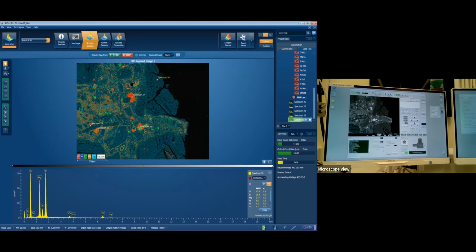Not whatever horrid color scheme I've made here. I've made worse. I've definitely made worse. Yellow is the main color. It's a faded pale green, yellow. Not pretty to look at.